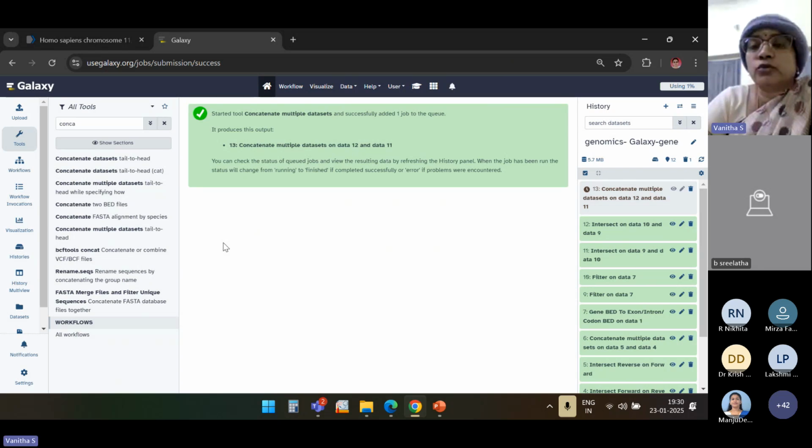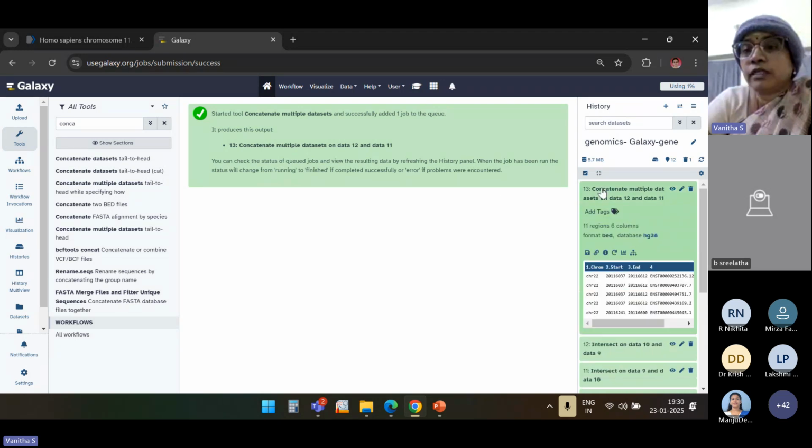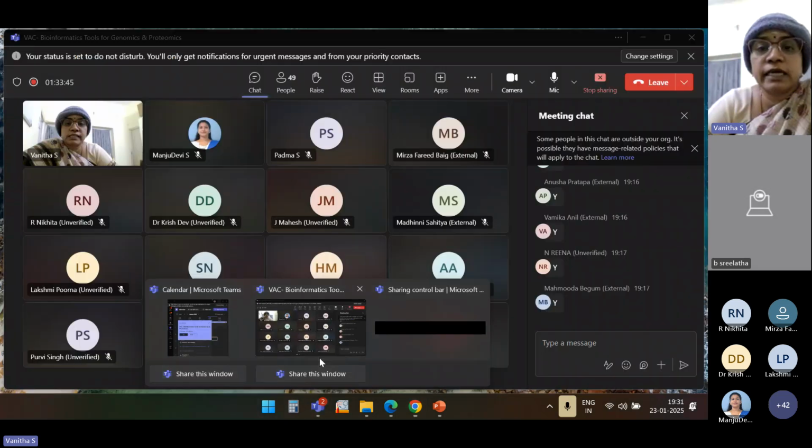So by using Galaxy, maybe you can try it out later. If I've gone very fast, anyway, we'll be sharing the PPT with you, so maybe you can look into that. Now you tell me how many regions it is showing you. Only 11 regions. Okay, so that is from my side.